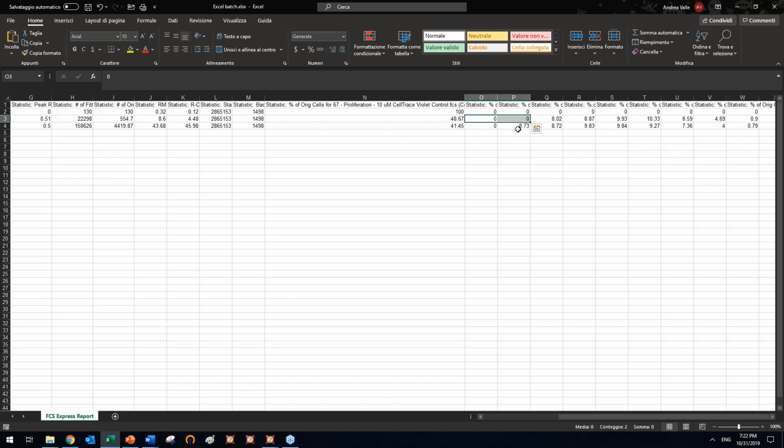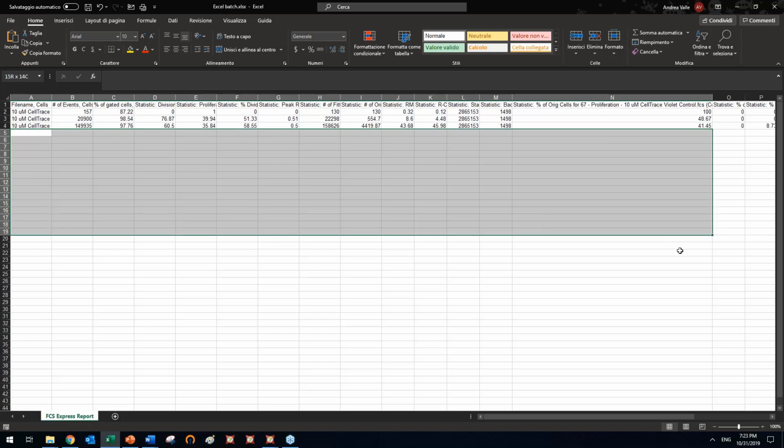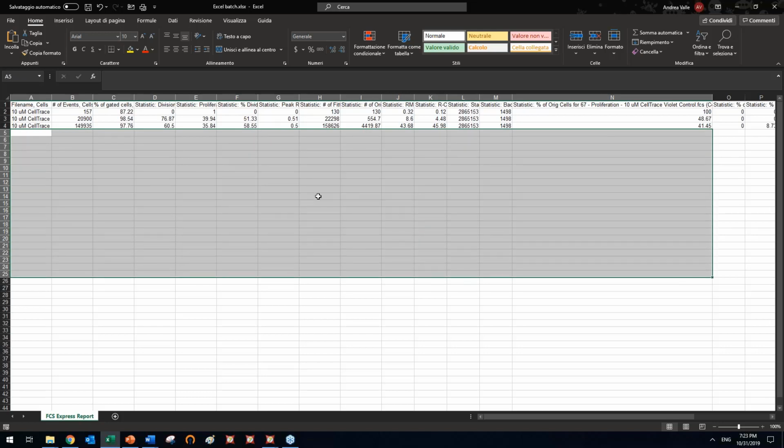And in this case, 2 population are 0, and then you have all the cells, and so on, and so on, and so on. And as I mentioned before, if you have a template like this and next week you want to export right down here, you can do that without starting with a new Excel.